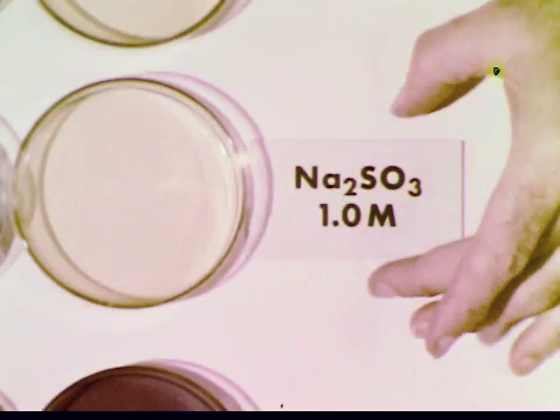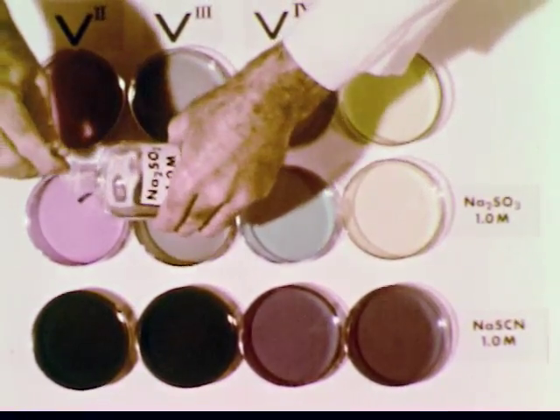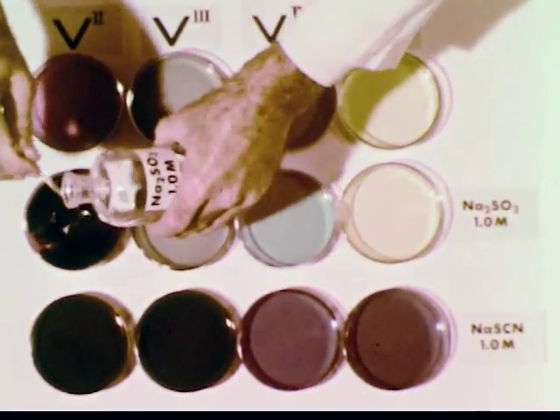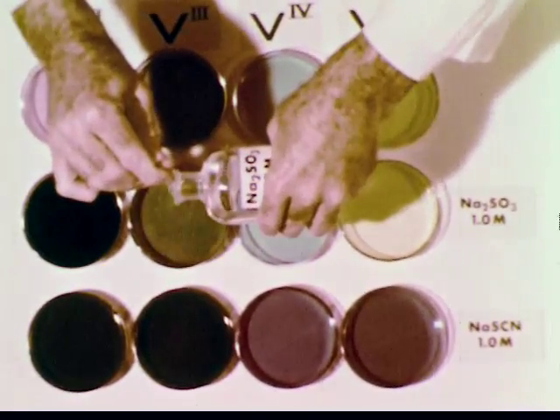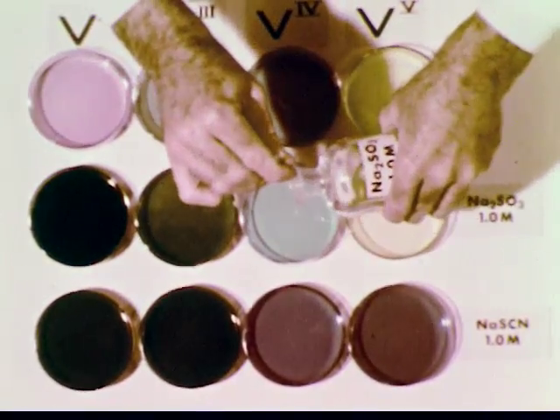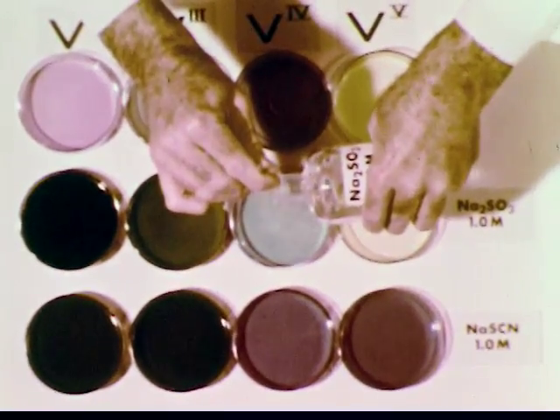Now let's add some sodium sulfite solution to the middle row. Still other species of complex ions are formed.